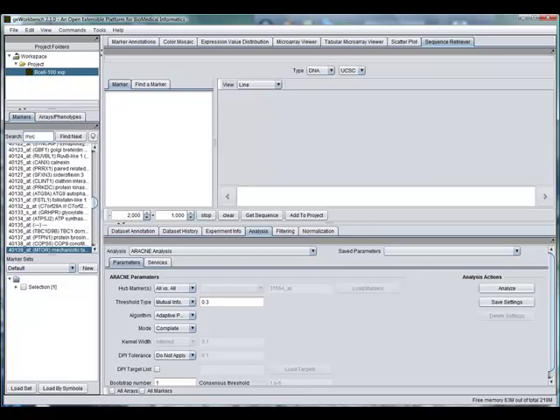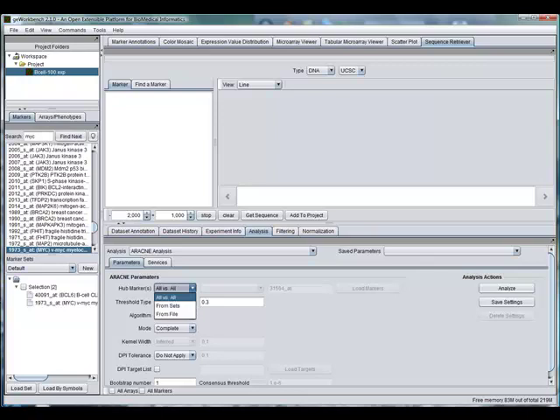MYC. There is more than 1 probe for this MYC gene. We will only select 1. So this is the one we're going to select. Double click. So you can see both markers are selected. We are going to use the set that we selected as a hub marker, the selection, and those are the 2 markers.